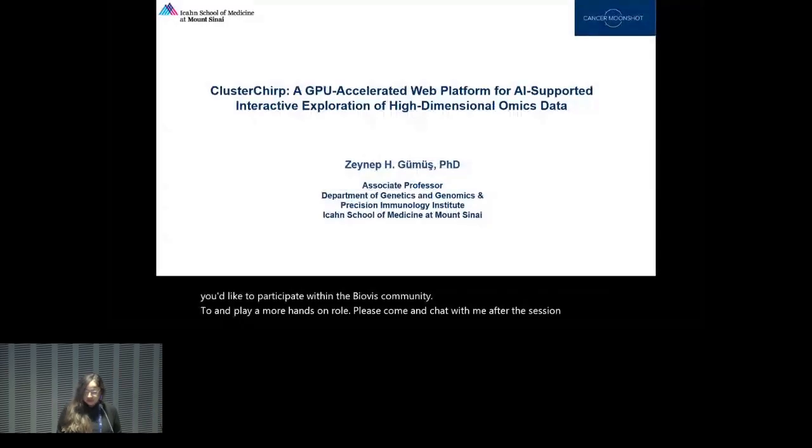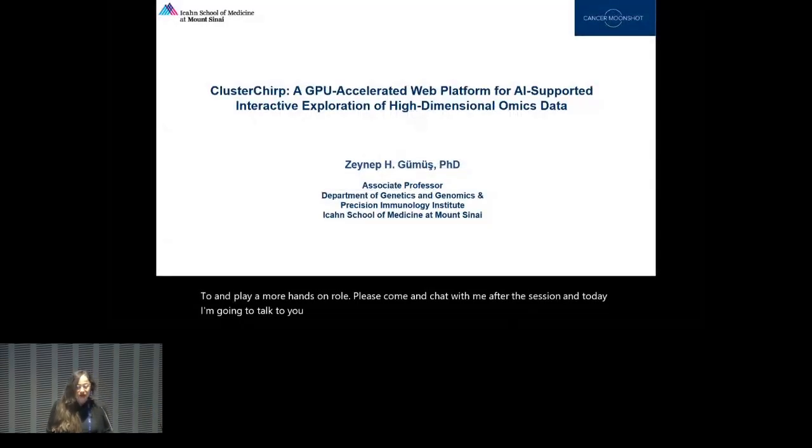And today I'm going to talk to you about a tool that we have developed in my research group at Icahn School of Medicine at Mount Sinai in New York City. It's called ClusterChirp, a GPU-accelerated web platform for AI-supported interactive exploration of high-dimensional omics datasets.